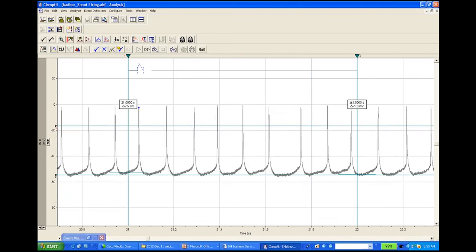Now in this one, instead of going to the auto, non-stop, you can also use this one manually. You can say accept it. Okay, accept. You can see there's a small diamond, and this one accept it. And then, okay, accept it. Now these two, let's reject it. Okay, you can reject it. You see, they will be rejected. And these two, let's say we can suppress it. Okay, suppress it. You can see the gray diamond. And these three, let's accept it and tag it. Okay, so you can see there's a huge diamond here, right?